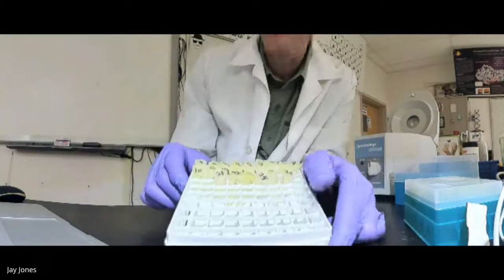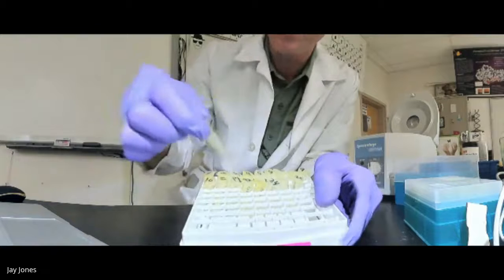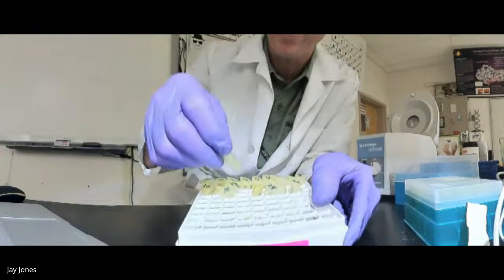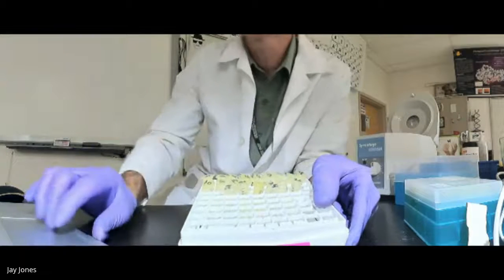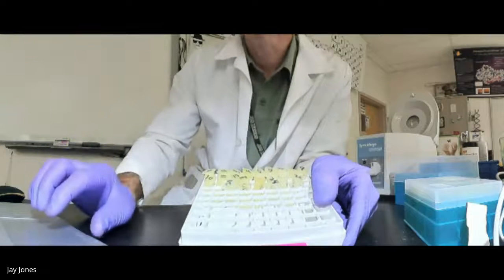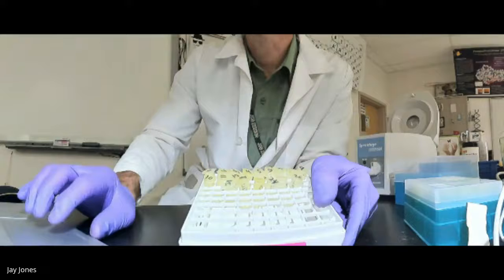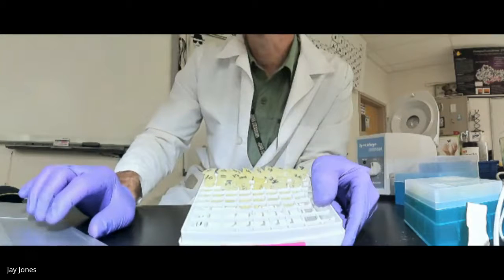Everybody has plasmid DNA. All of these have 60 microliters of purified plasmid DNA. And that is the mini prep done. I'm going to store these per the clone report sheet. You know, I might as well just show you real fast while I'm still presenting.